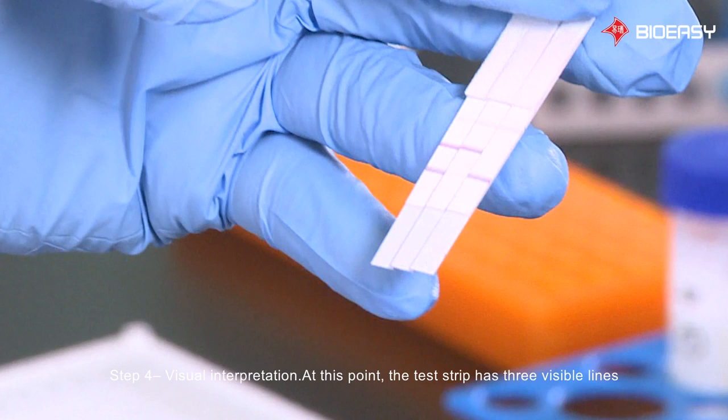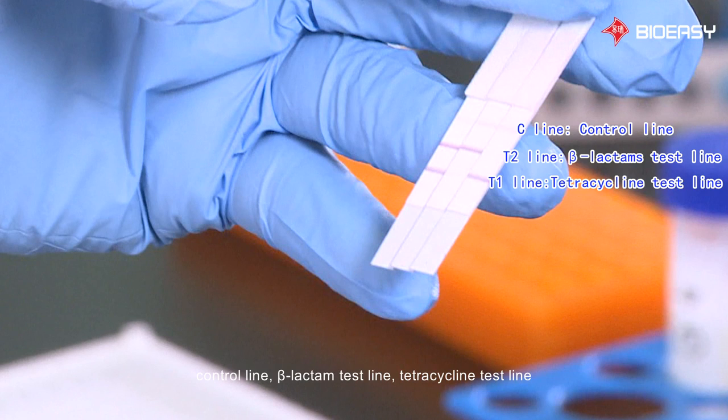Step 4: Visual interpretation. At this point, the test strip has 3 visible lines — from top to bottom: the control line, the beta-lactam test line, and the tetracycline test line. When the test line color is darker than the control line, the result is negative.